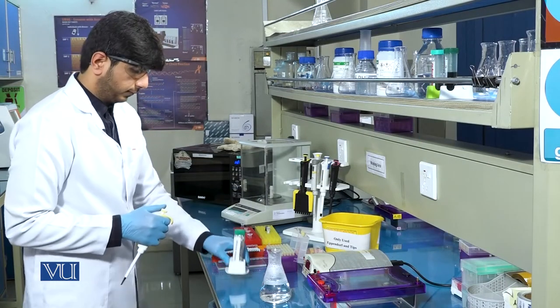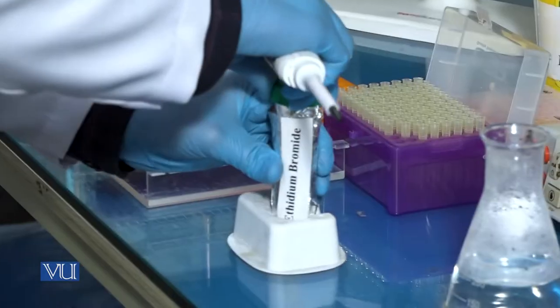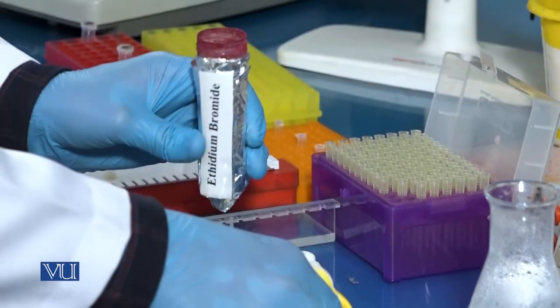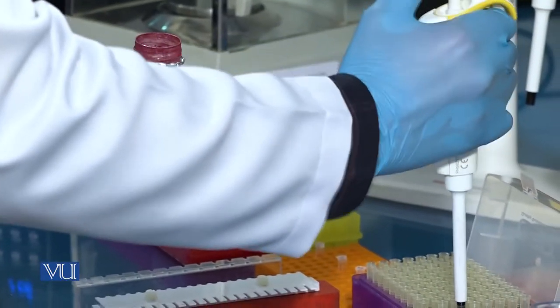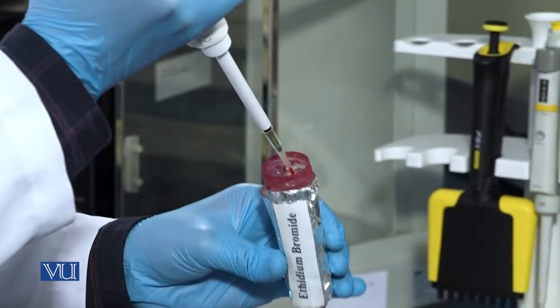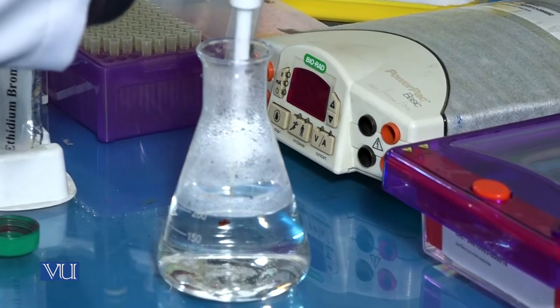Now add 7 to 8 microliter ethidium bromide into the gel flask. It must be noted that ethidium bromide should be handled carefully because it is a carcinogenic dye.